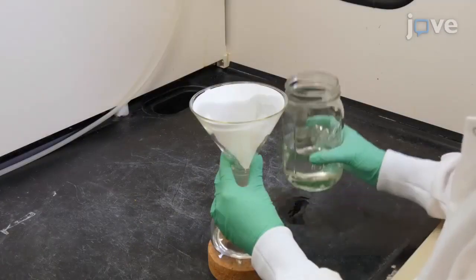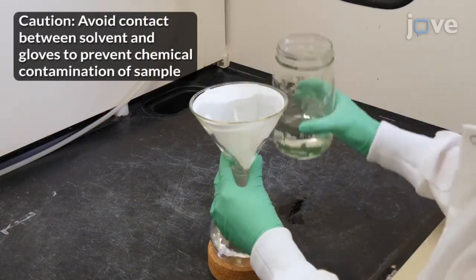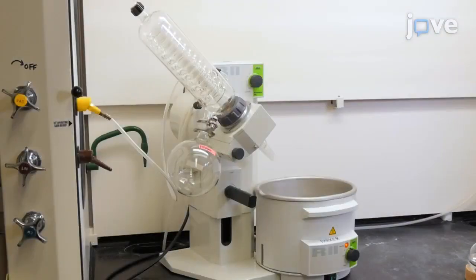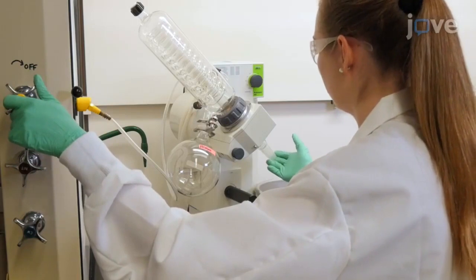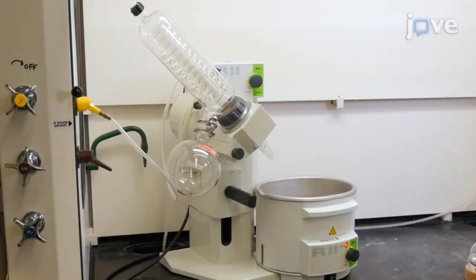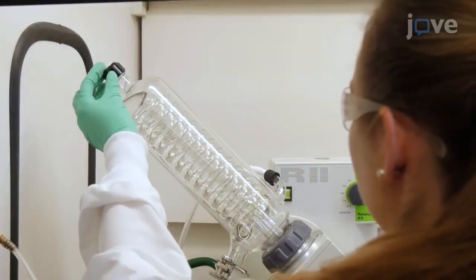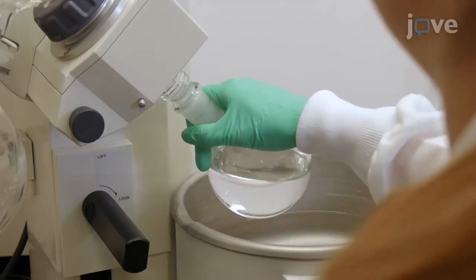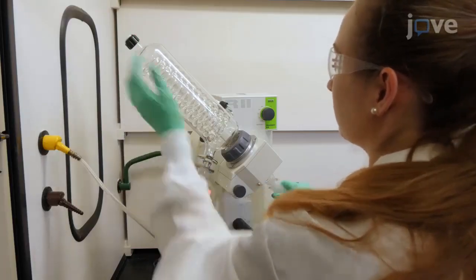To determine the extracted lipid mass, transfer the extract to a pre-weighed round-bottom flask and turn on the vacuum source to the rotary evaporator, making sure that the vacuum pressure is sufficient to hold the flask to the neck of the condenser. Open the vent at the end of the condenser, slide the flask onto the neck of the condenser, and close the vent to seal the system.